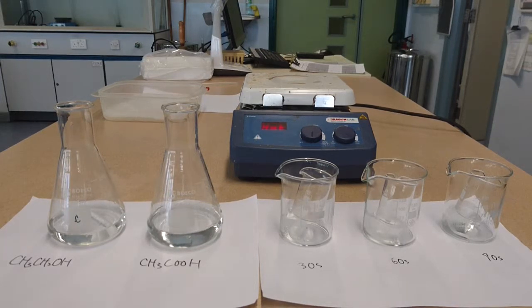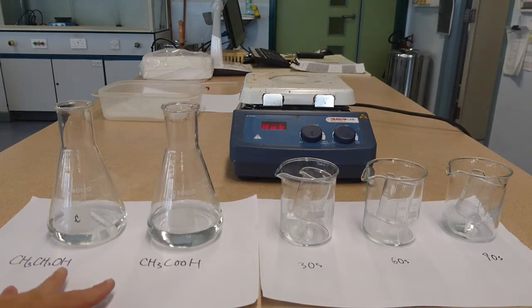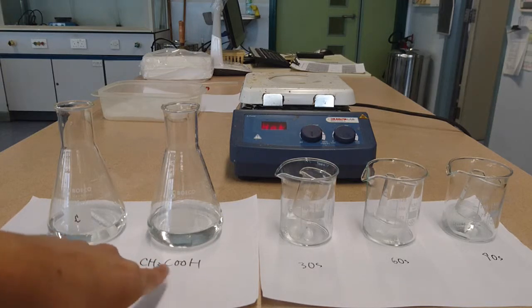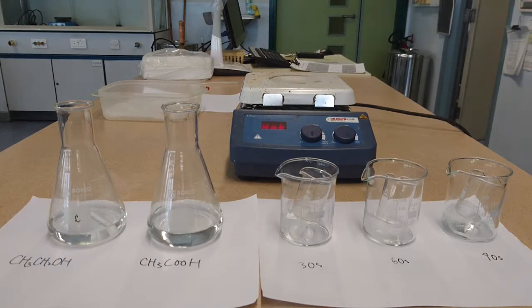So okay, now we are going to demonstrate how we are going to track the experiment using the titration method. You can see that there is a hot plate and the reaction will be ethanol and ethanoic acid. The ethanol can react with ethanoic acid to form ethyl ethanoate. This is quite a slow process, and we can monitor the rate of reaction by looking at how much reactant is left behind. The easier way is to do the titration of the reactant left behind and see how the reaction is progressing.